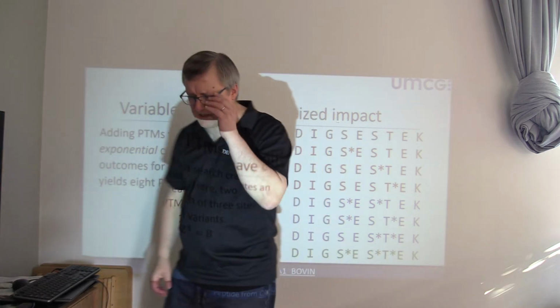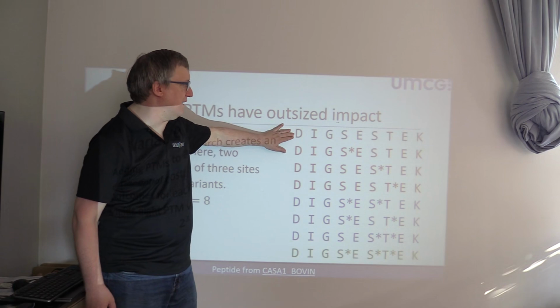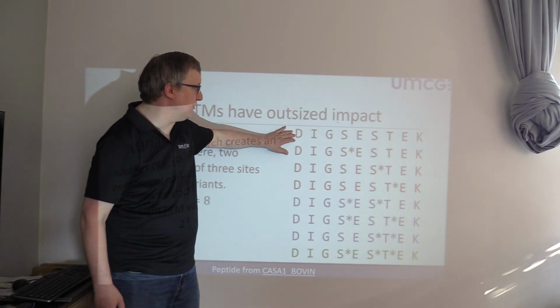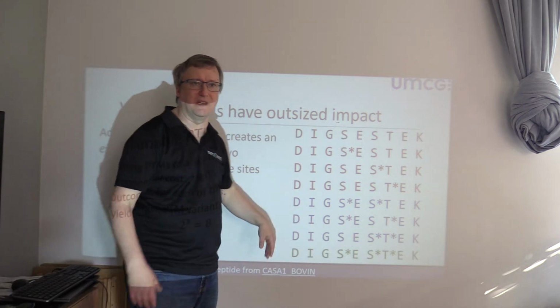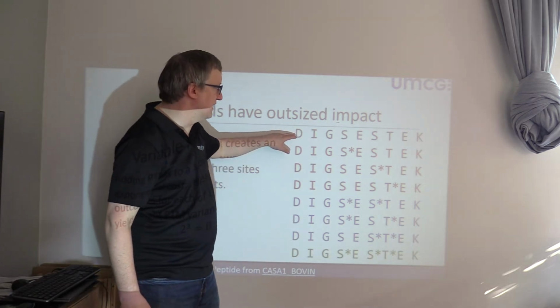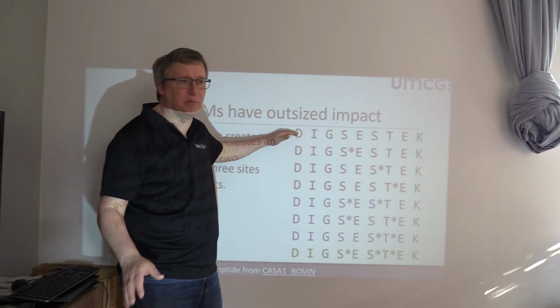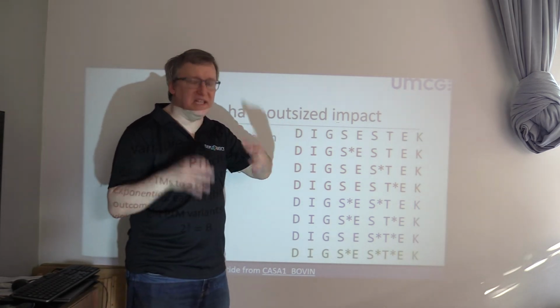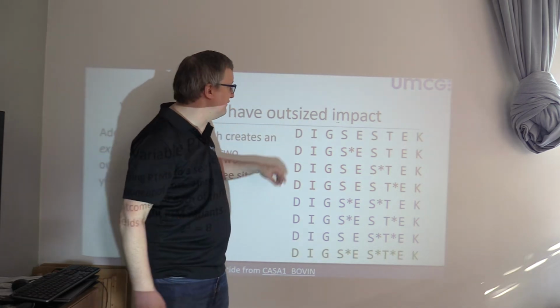All right, now I'm going to stand on this side for this. In this case, we have a 9 amino acid peptide. It's one drawn from alpha S1 casein, and it's valuable for making the point of why PTMs expand the search space for proteomic identification.